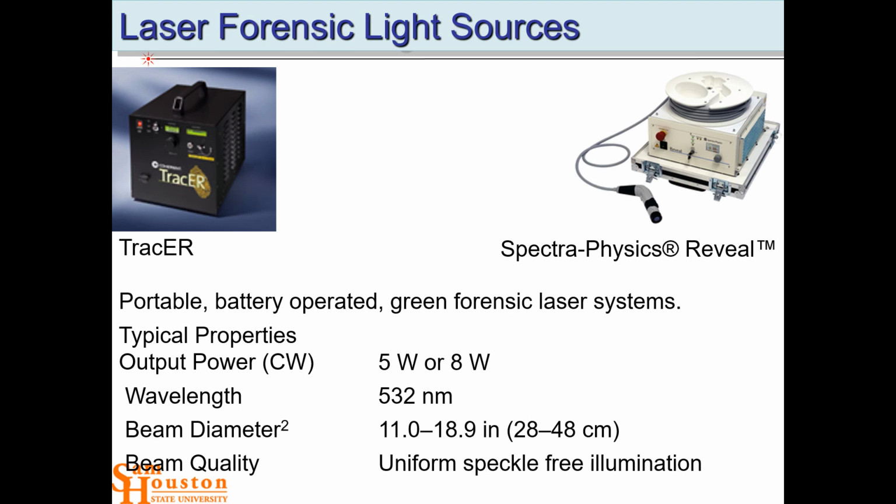Now, we have laser light sources. Here's a couple of them. Spectra-Physics is a large volume laser manufacturing company. This one's been ruggedized for crime scene use. You can see it's on this little platform. There's a box that goes over, snaps together to protect all of the fragile components. But it's on this fiber optic wheel, so you can drag this around a crime scene and illuminate what you need to illuminate, and then you can go back and wind the fiber optic back up.